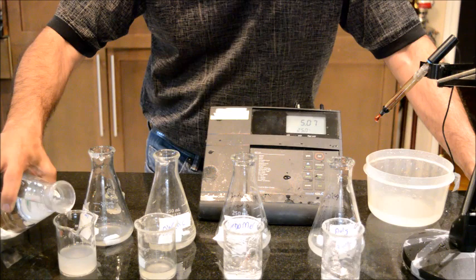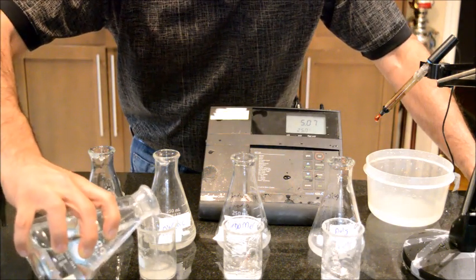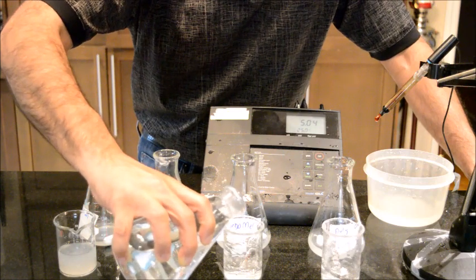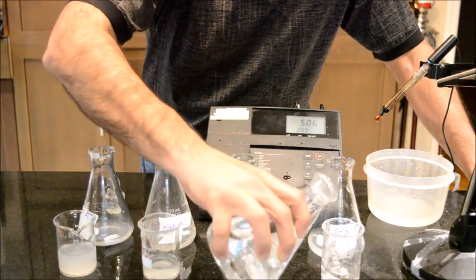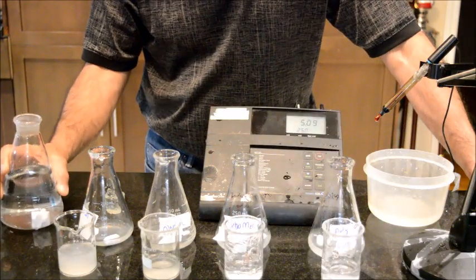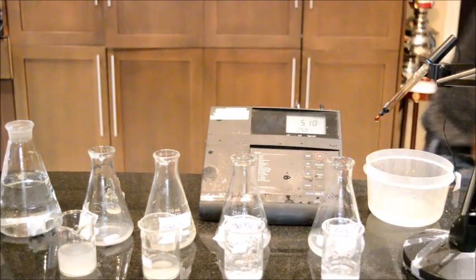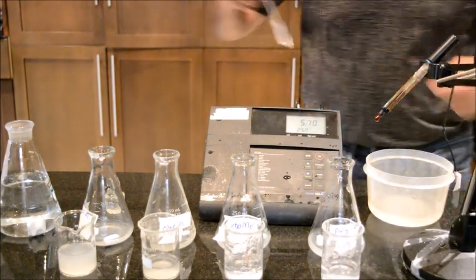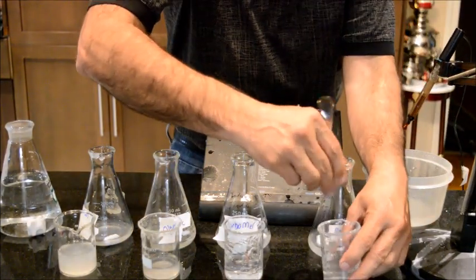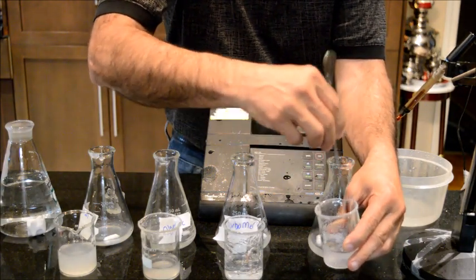And a little bit more or less try to put the same in each, probably 1-to-1 ratio, and see how they are behaving. This is more or less a 1-to-1 ratio. I'm going to mix them up and see how they will become.